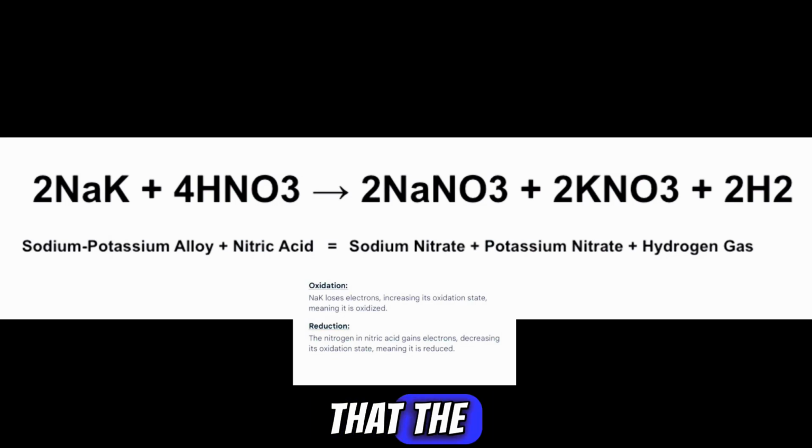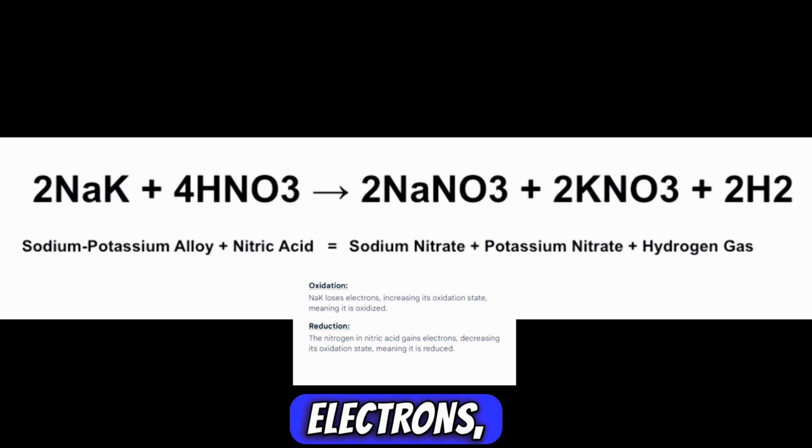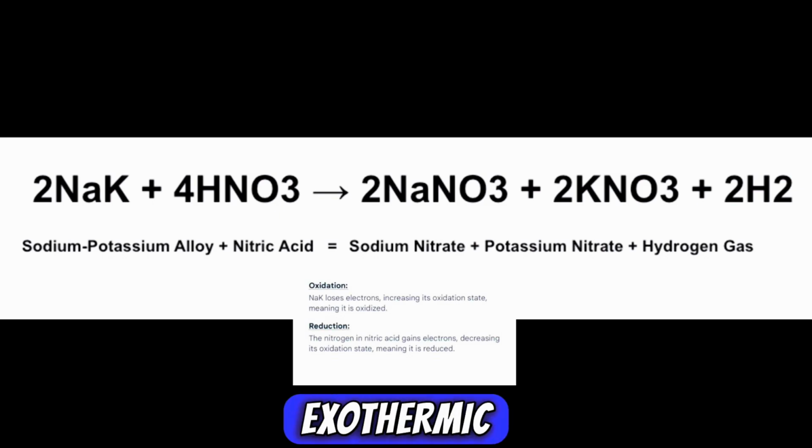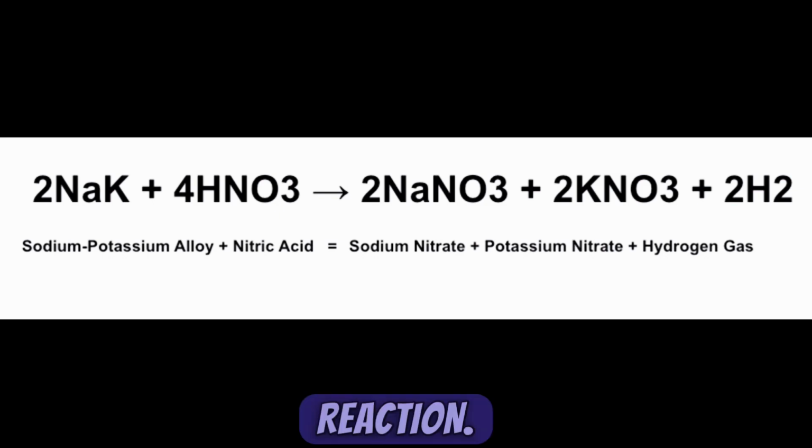We can see that the alloy of sodium-potassium is being oxidized. As it's losing electrons, its oxidation state goes up, whereas the nitrogen in nitric acid is being reduced as it gains electrons in this amazing exothermic redox reaction.